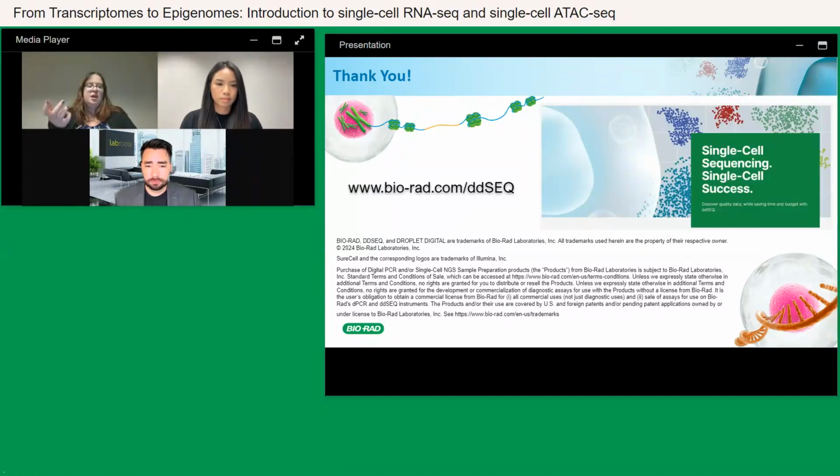To give a number to that, we're using what's known as a Jaccard index similarity score. The higher the Jaccard score, the more reads are shared compared to unique. If it's a low score, more of the reads are not shared. So two beads that have a very high Jaccard index have a lot of reads that share the same start and stop positions. They more likely come from the same droplet and can be brought back together to recapitulate the original cell.